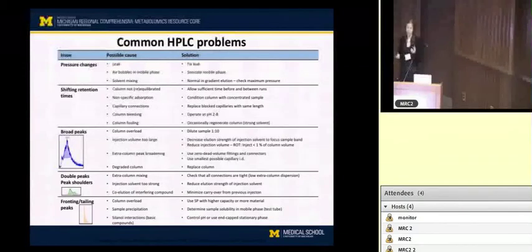And in a complex sample such as plasma, for example, there's always going to be something that will attach to your column and not come off with the solvents that you're using. Over time, this stuff will either build up or it will create something irreproducible that interacts with your sample. And you don't want that to happen. So that's another argument for always regenerating your column properly.